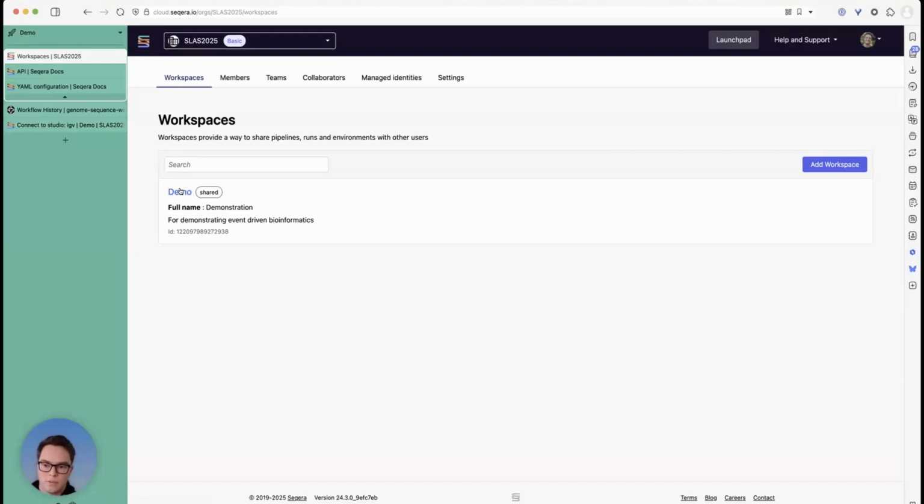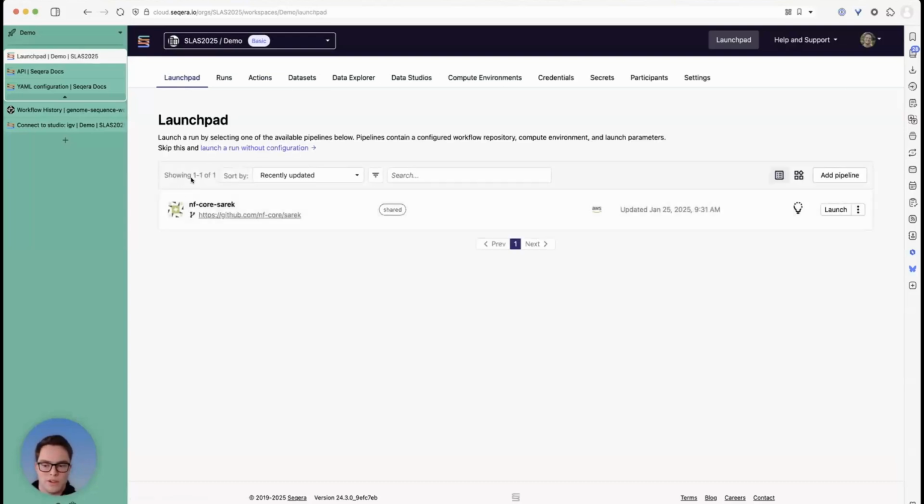So let's dive into our workspace. This could be for a specific R&D project. This could be for various other things. It could be coming off of sequencers. You can house those however you want. And so we need to start from the back. First, we're going to talk about some of the setup of the Seqera Platform whenever you get in, because we have a BYOB policy of bring your own bucket. And then we'll dive into some other things.